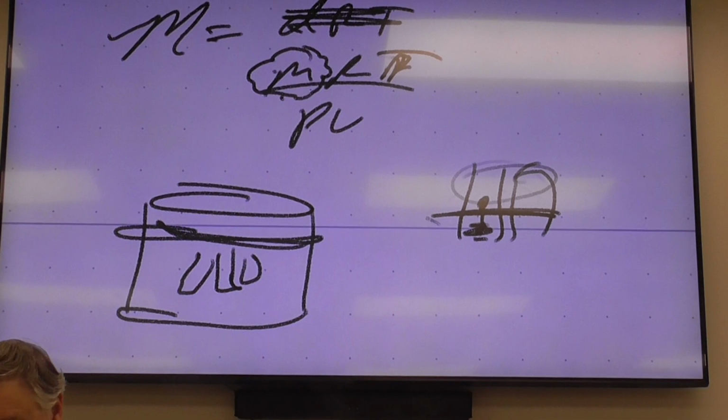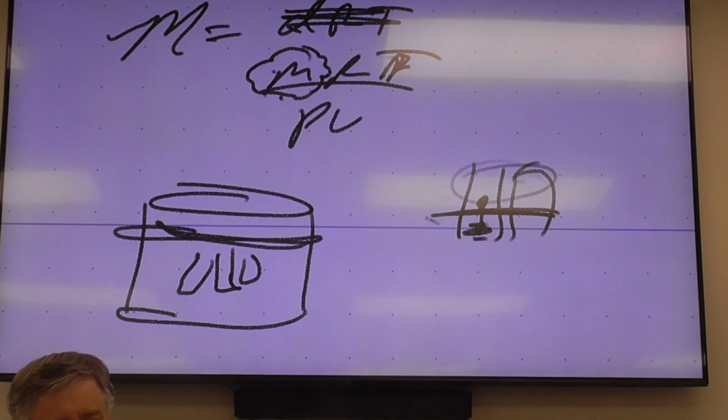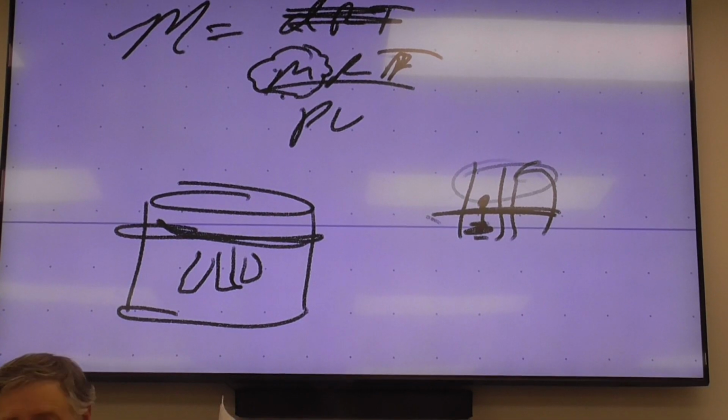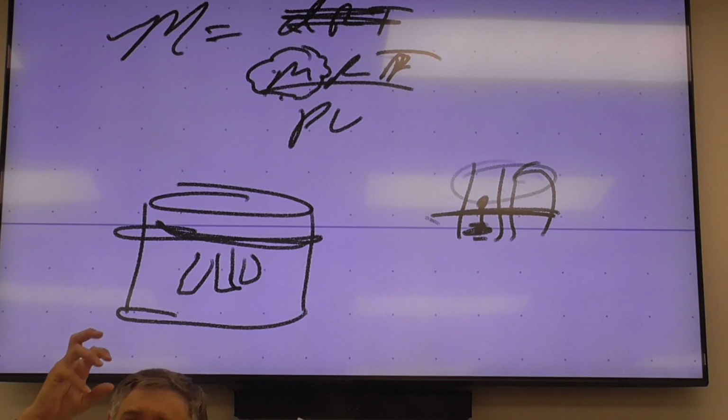So over here on this second page, and again, you're only going to do one of these. You're going to have the mass of the pipette of the condensed ethyl alcohol. Okay, so you're going to have the mass of the empty one. Then you're going to let it boil, let that condense, dry it off, and you can have that. So then you can find the mass of the condensed ethyl alcohol, or whichever one that is.